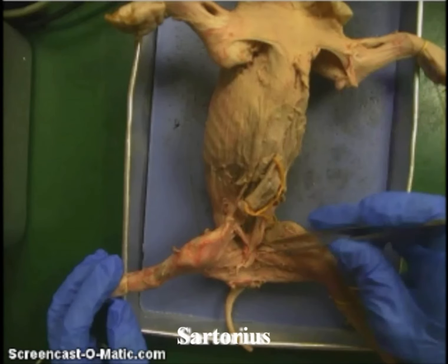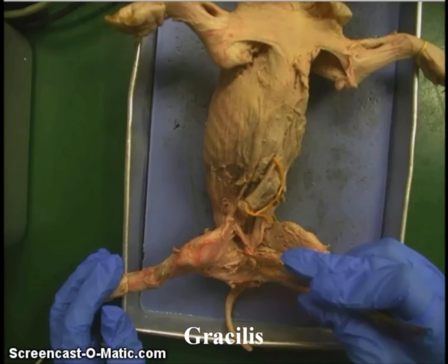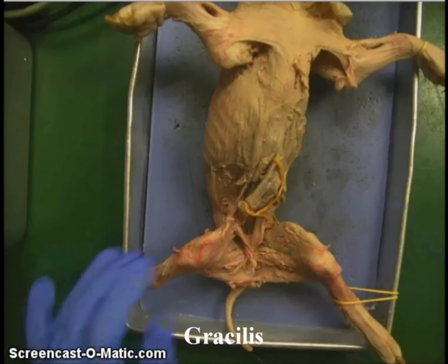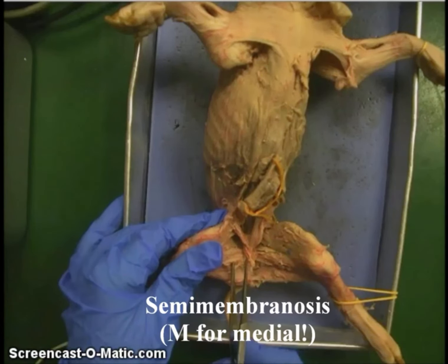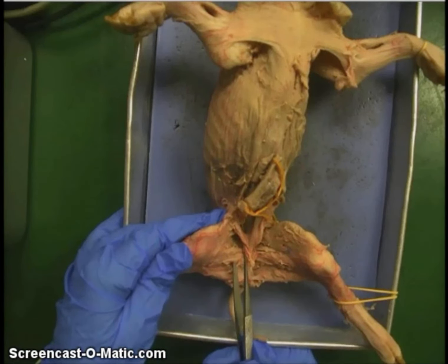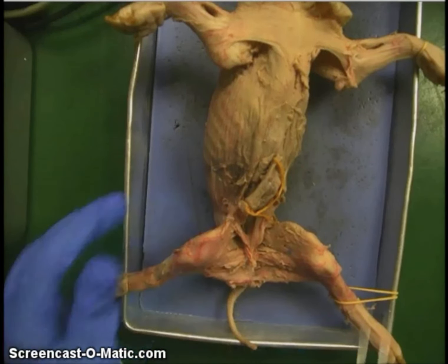The sartorius is right between my tweezers, right there. It's really skinny and kind of hard to find, but it's kind of below the vastus lateralis. The gracilis is right between my tweezers there. You can kind of see my tweezers going under the gracilis, and if you cut through that part, you would see the semimembranosus. Remember, semimembranosus, M for medial view.